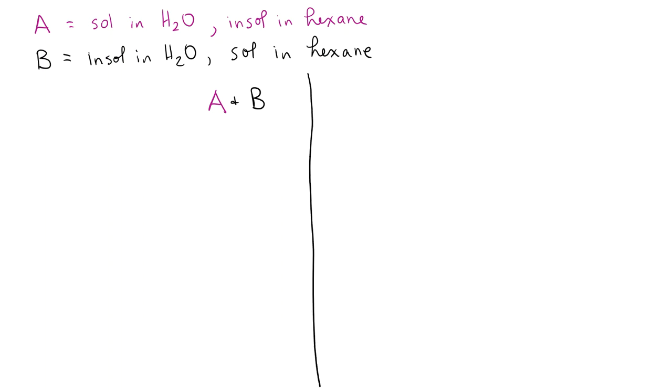The first possible route, let's see what happens. And I'm going to just move this over real quick because I decided I was going to do 2 routes. I'm going to move this over to here. All right. Let's say we take this mixture of A and B and we add water to it. So we add water, we stir it, we make sure we give it some time.